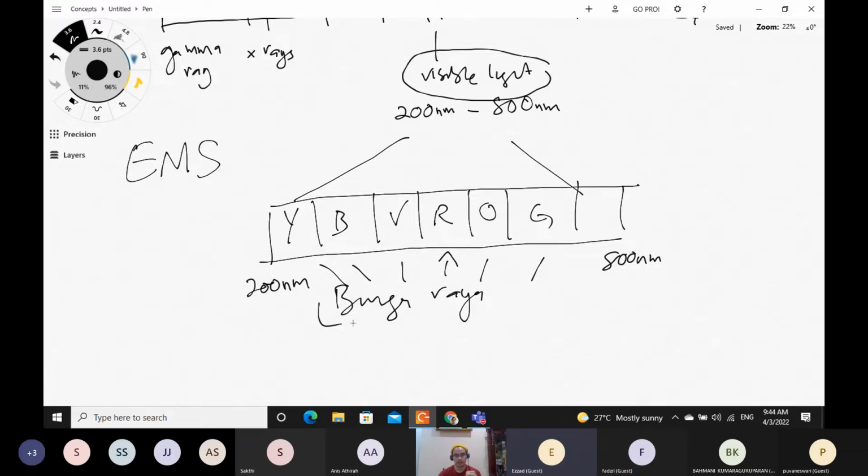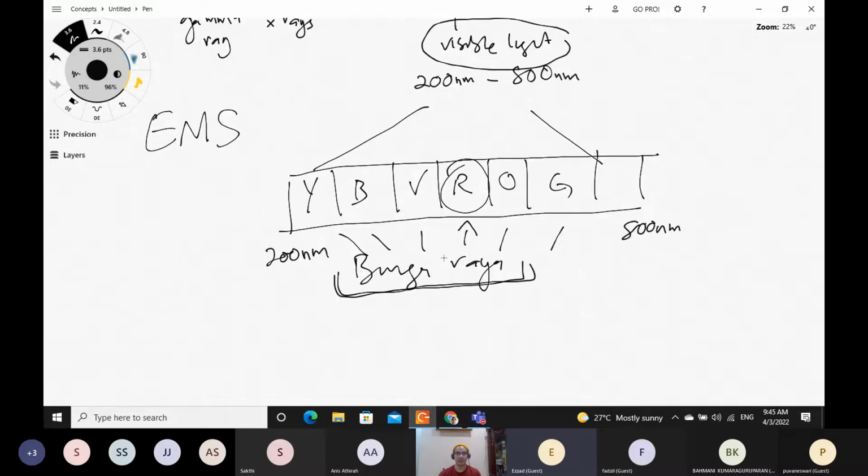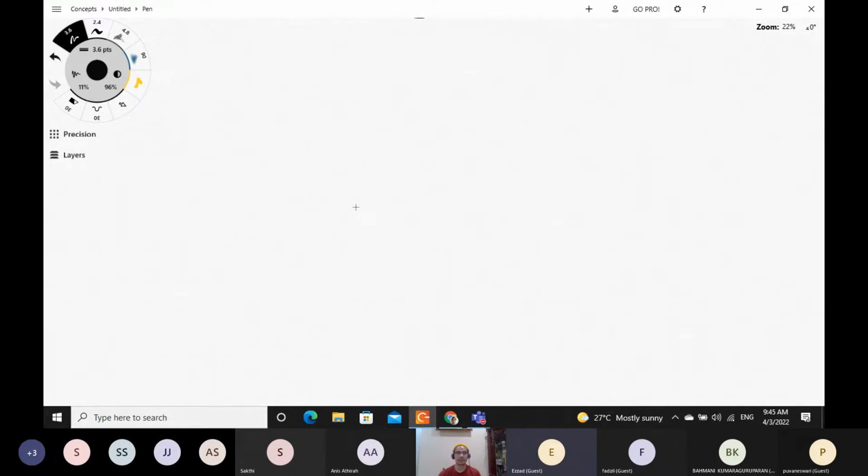So this is how kita guna this trait. Some molecules in bunga raya tu, the dominant molecules yang ada dalam bunga raya tu, they absorb all the other colors and they reflect, they emit only a red color. So that's why we can use this trait of molecules and atoms untuk kita kenal pasti, because they have certain preference untuk serap dan pancarkan certain wavelength of light. So that's why in chemical analysis kita boleh gunakan this behavior of atoms and molecules untuk serap dan pancarkan cahaya ini sebagai dia punya ciri-ciri untuk kita kenal pasti.